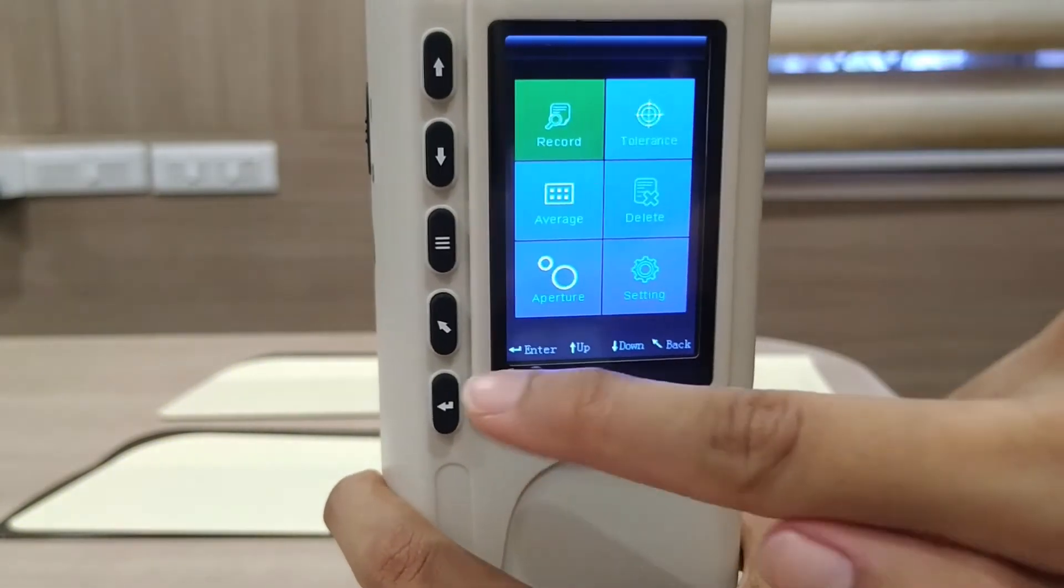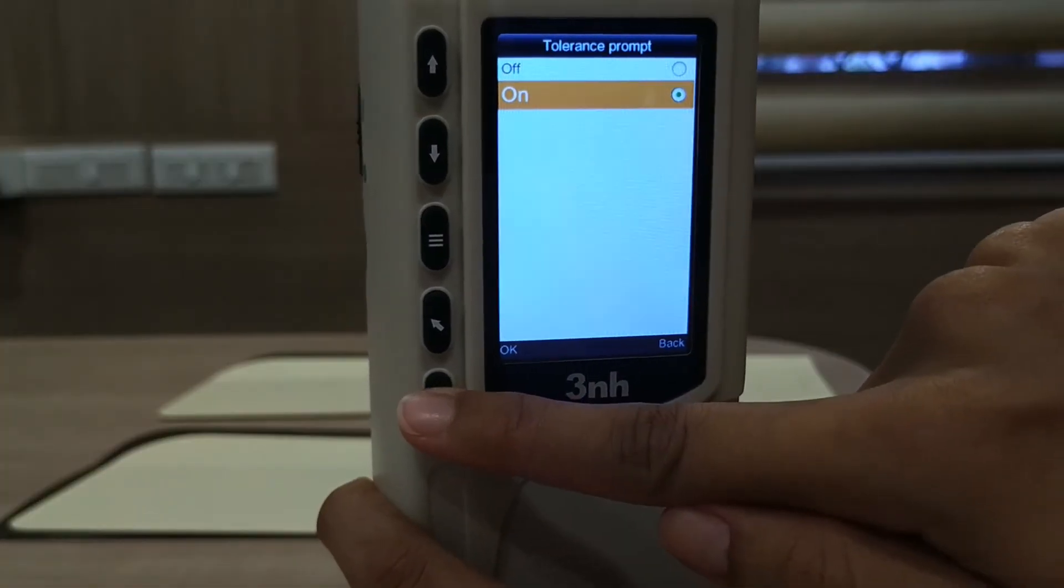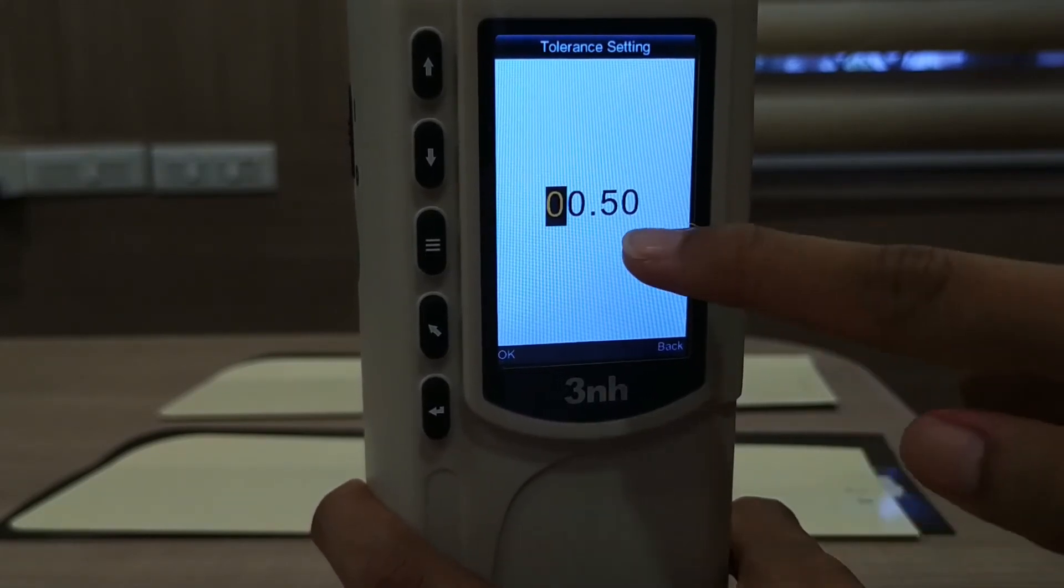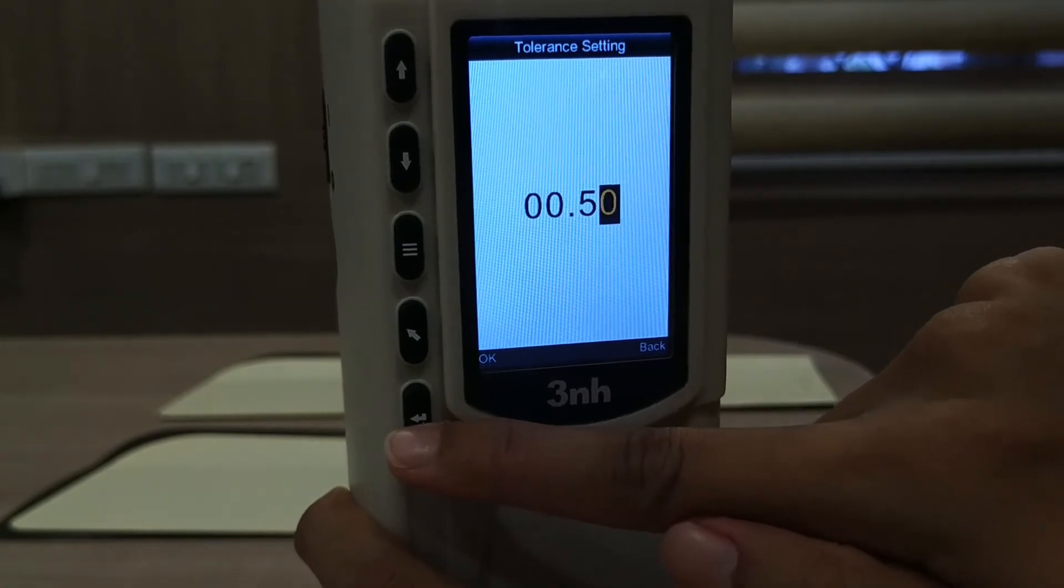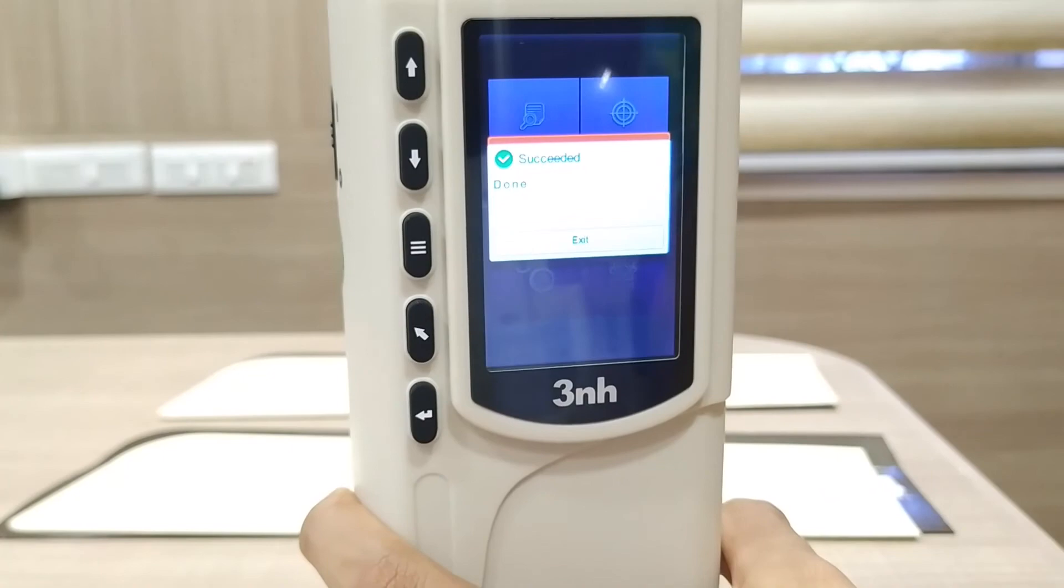Switch it on. I am going to set tolerance levels to 0.5, which is accepted in all industries. I have now set the tolerance level.